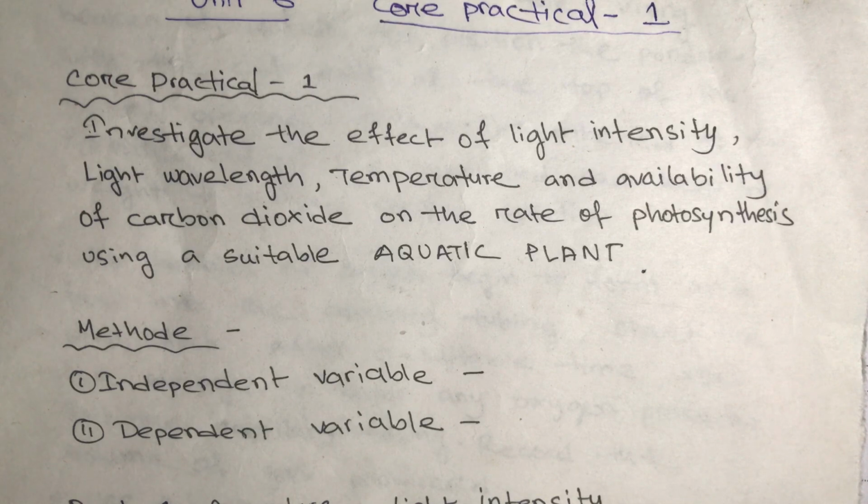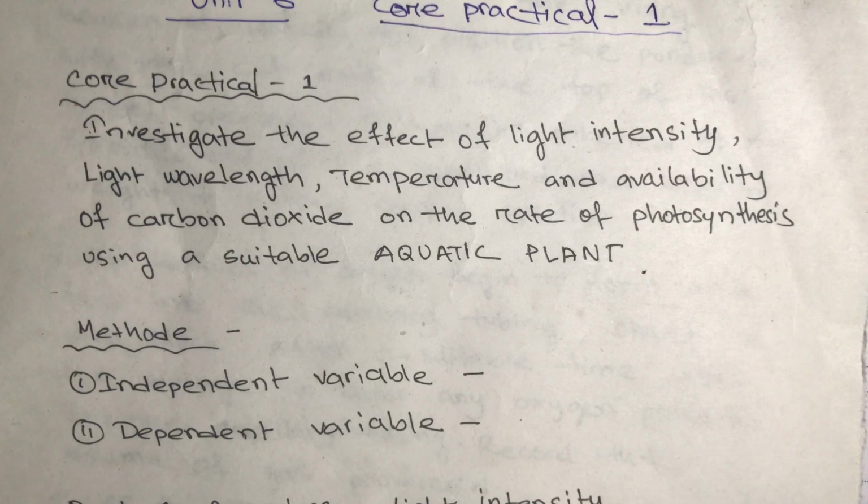So this is the variable we need to find. To calculate our result, we can figure out the volume of oxygen, then compare across each of the variables to see which has the higher amount of oxygen production.